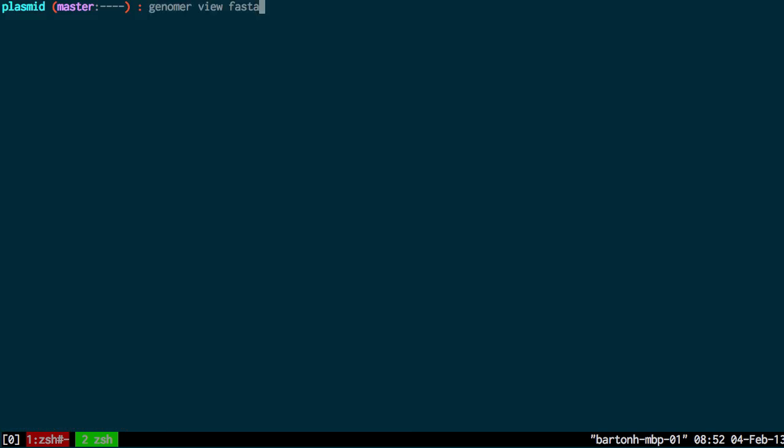So what I want to do is specify an identifier for this sequence. When you submit a genome project to GenBank you must first request an identifier for your genome. This is the identifier for my genome here. I'm then going to pipe the output to a file which I'm going to call plasmidfna.